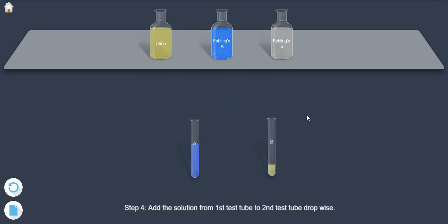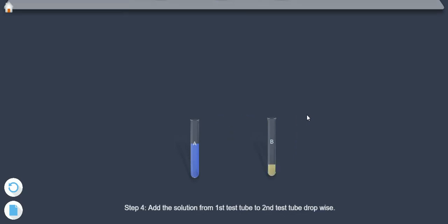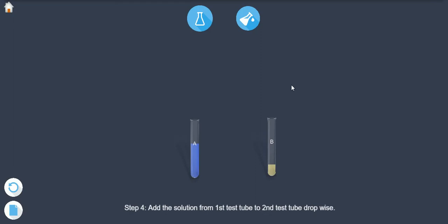Step 4: Add the solution from first test tube to second test tube drop wise.